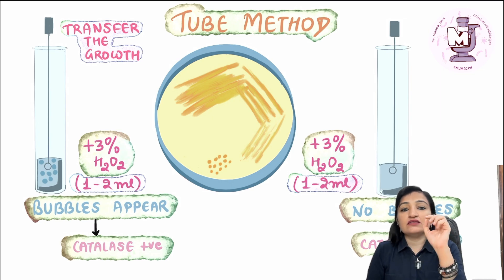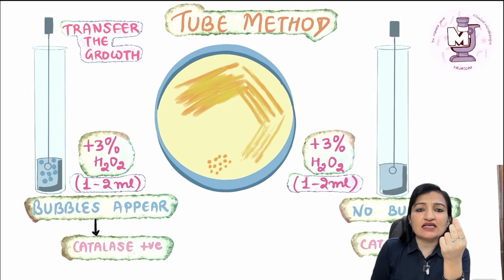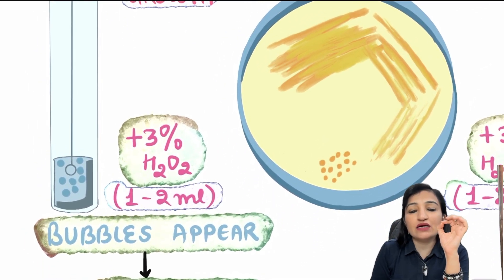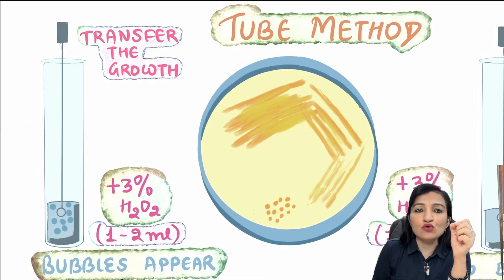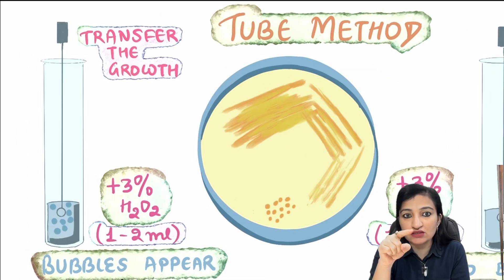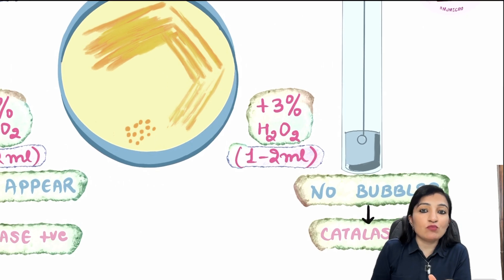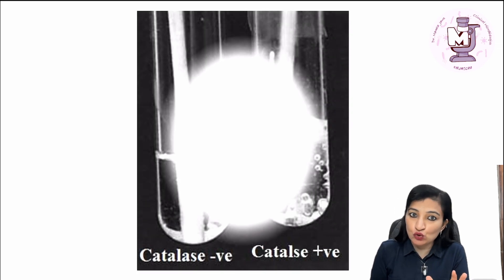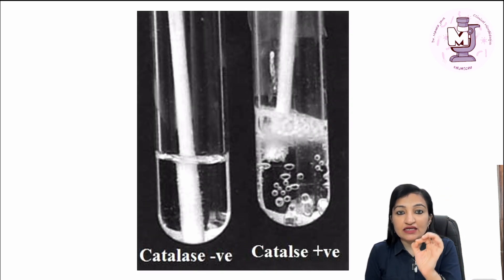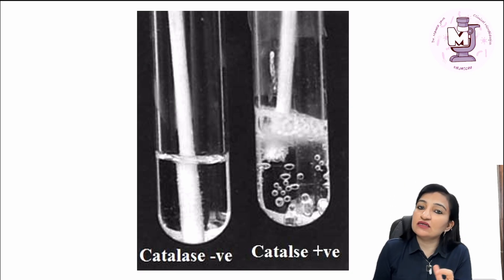The second method is the tube method. Here also, 18 to 24 hour old colonies are used. As the name implies, the test is carried out in test tubes. Add 1 to 2 ml of 3% H2O2 to the test tube, then transfer the colonies into the tube using a sterile inoculation loop. If bubbles appear, the test is positive. If no bubbles appear, catalase test is negative. On the left is the negative catalase test tube method; on the right is the positive catalase test tube method.